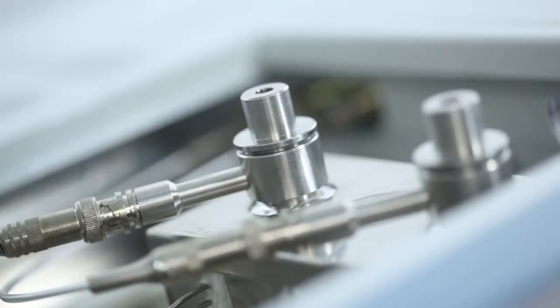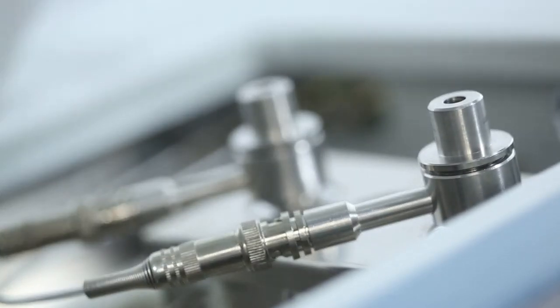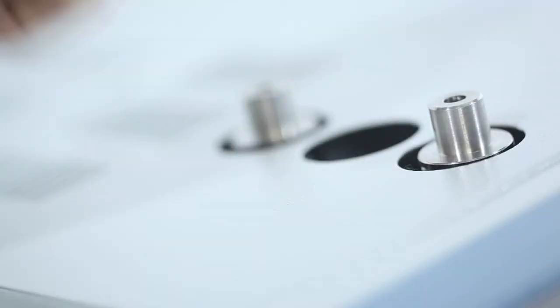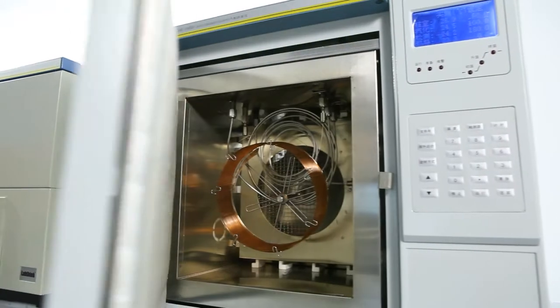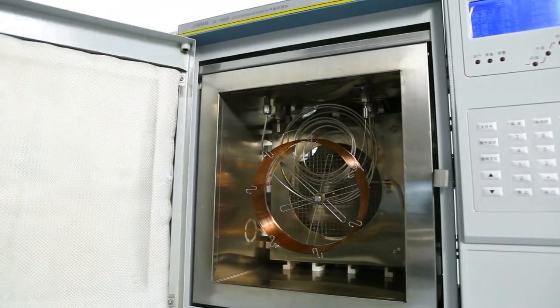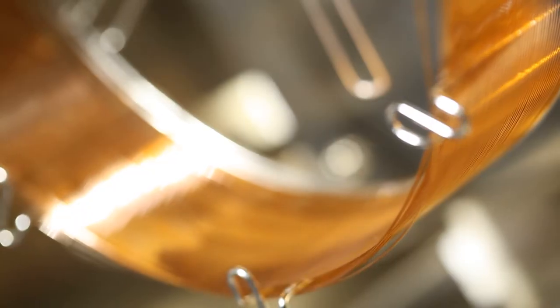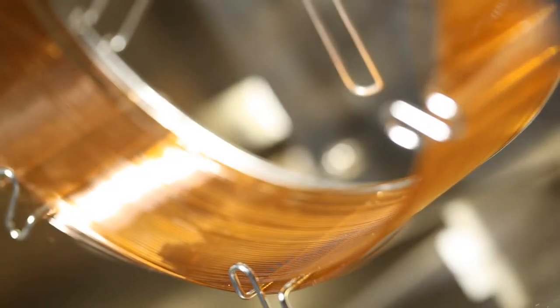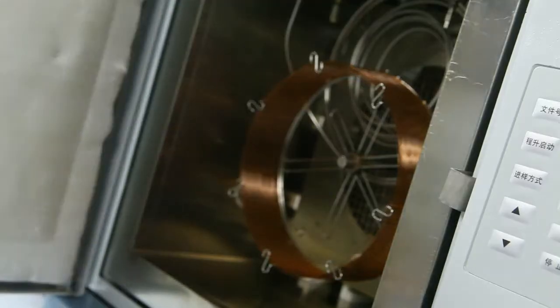The gas chromatograph has both an FID detector and a TCD detector which are paired with a capillary column and a packed column correspondingly to test the purity of a particular substance and the relative amounts of such components in a mixture.